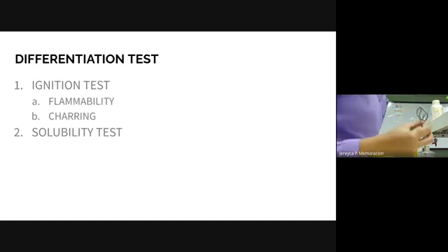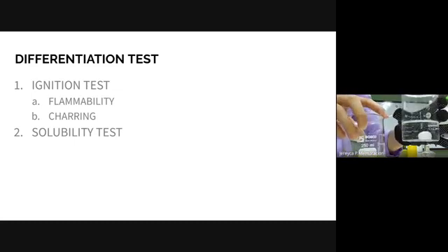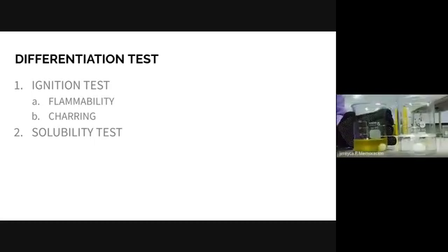In two separate containers, we have here our distilled water with mothballs, and this is our distilled water with naphthalene.